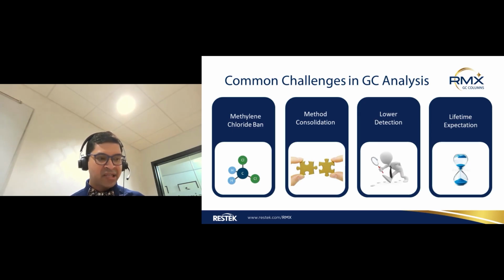Now, the ban actually cascades further as well, right? So the disposal cost of methylene chloride goes really high. And then the exposure limit has also been reduced for people who are handling methylene chloride. And storage also becomes an important issue. So now labs are looking at ways where they can actually reduce the consumption of methylene chloride or go for an alternate method of extraction or lower volumes of different solvents. So that's one of the primary challenges that this industry faces.